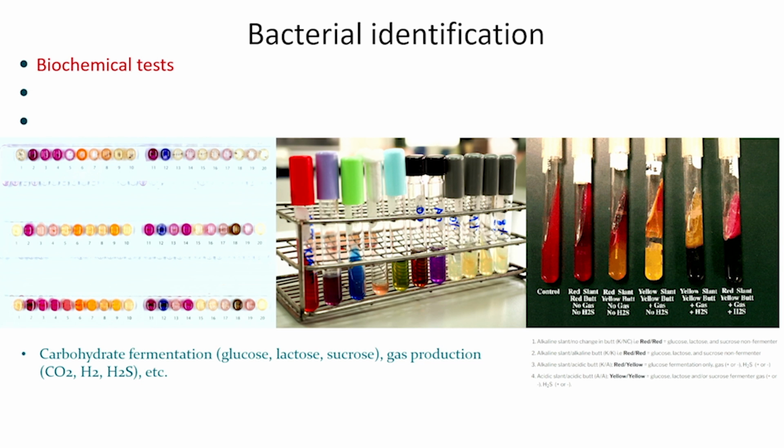So after we isolate those little colonies, and one colony came from a single microbe, remember, we can apply a huge range of biochemical tests with these specific colonies to see what these microbes are capable of doing. So let's suppose we have here a range of carbohydrate tests where we can see which carbohydrates they can ferment. And that tells me potentially who they are, right?